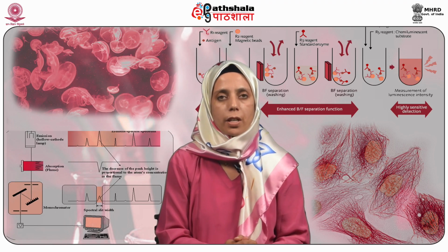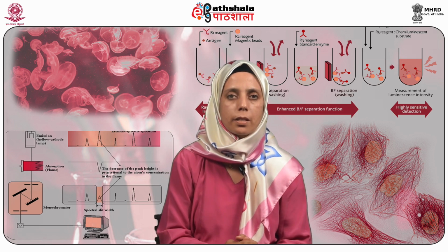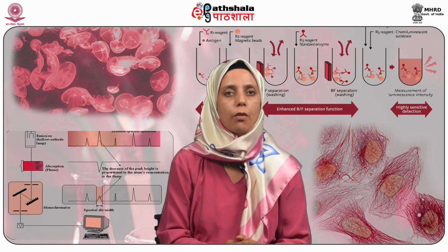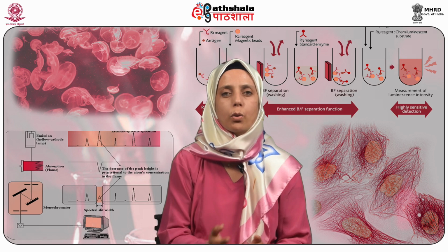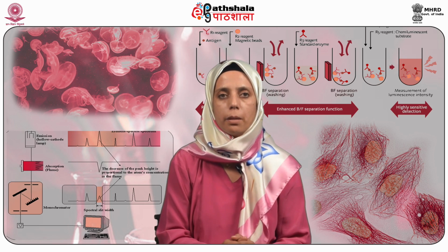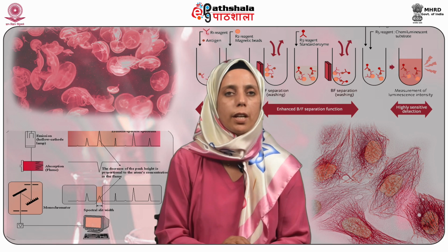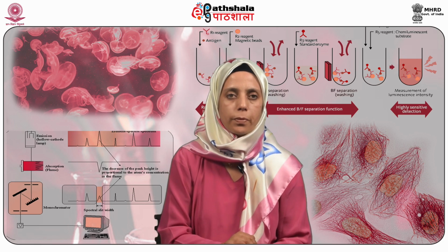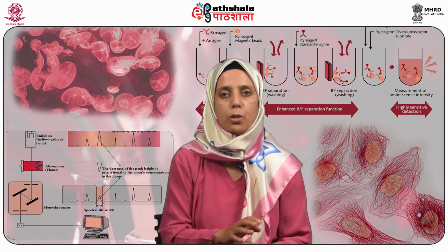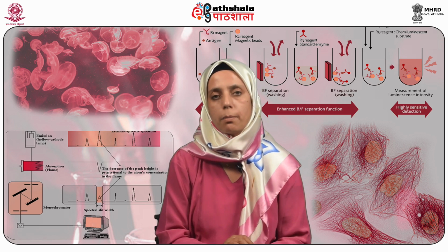An interference wedge consists of a pair of mirrored, partially transparent plates separated by a wedge-shaped layer of dielectric material. The length of the plates ranges from about 50 to 200 millimeters. The radiation transmitted varies continuously in wavelength from one end to the other as the thickness of the wedge varies. By choosing the proper linear position along the wedge, a bandwidth of about 20 nanometers can be isolated.